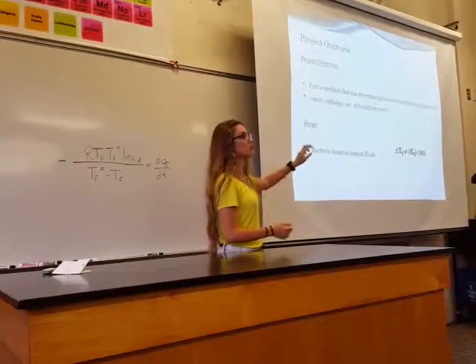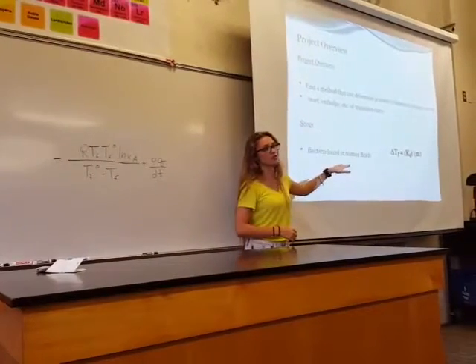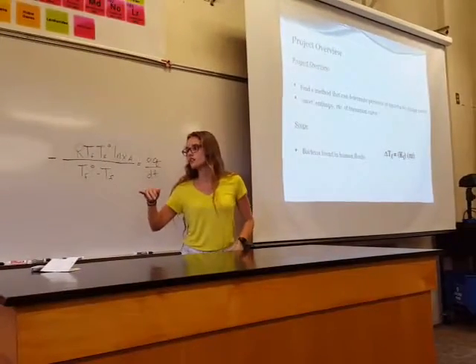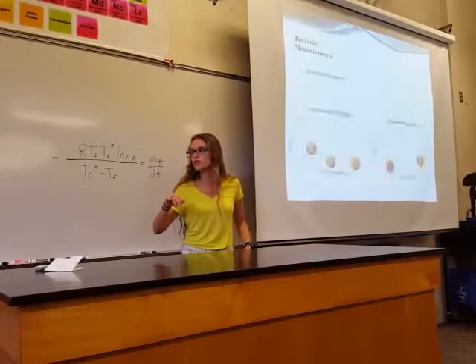And then that sample would be run again on the differential scanning calorimeter, creating a shift in, if you could go back to the last graph, yeah, with the 3 samples.